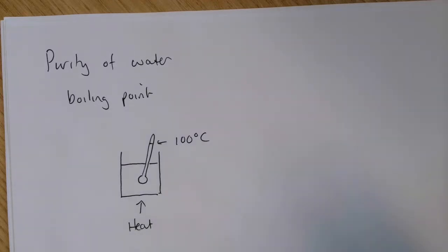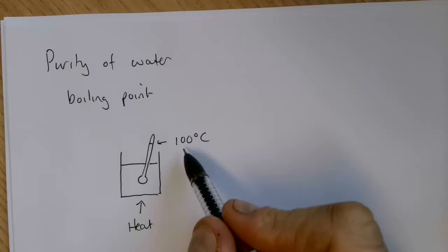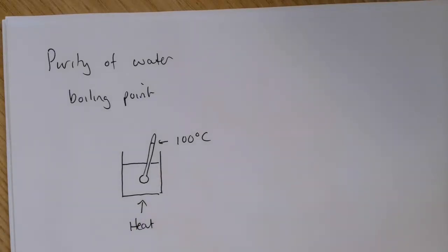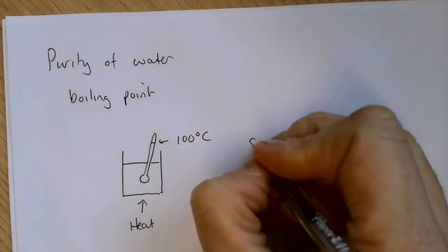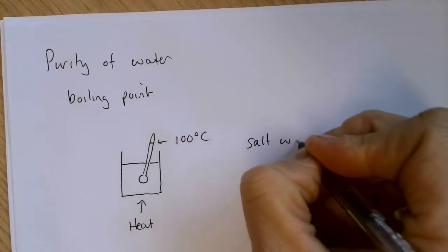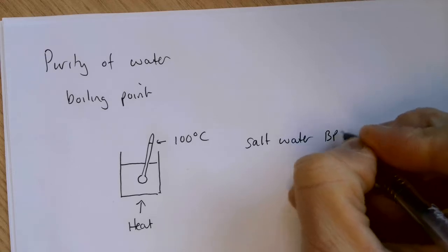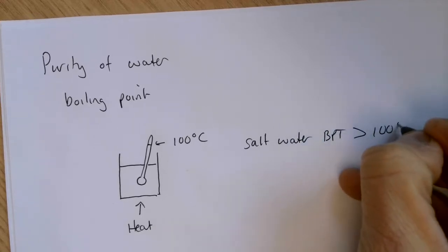If we heat this water, the point at which the water starts to boil should be 100 degrees Celsius for a pure water sample. So this is one of the main ways that we can identify whether or not a water sample is pure. If it boils at exactly 100 degrees Celsius, it's pure water. Salt water would have a boiling point greater than 100 degrees Celsius depending on the amount of salt dissolved in it.